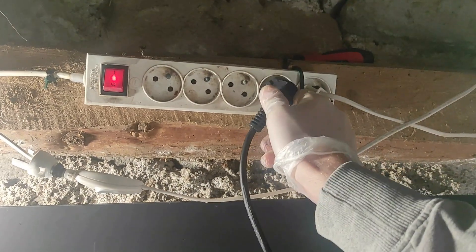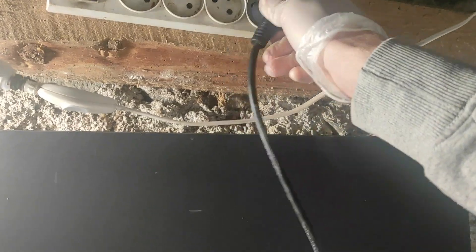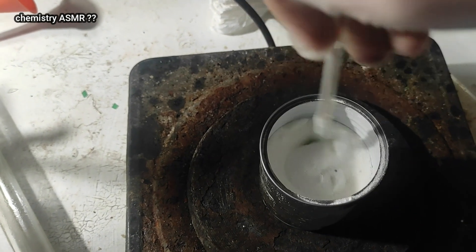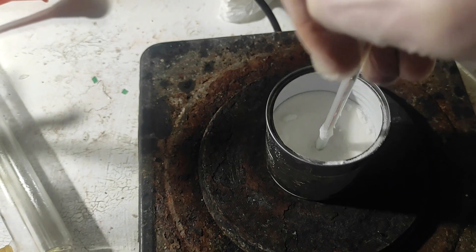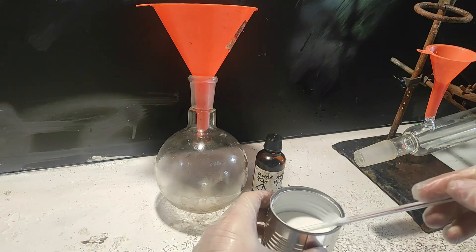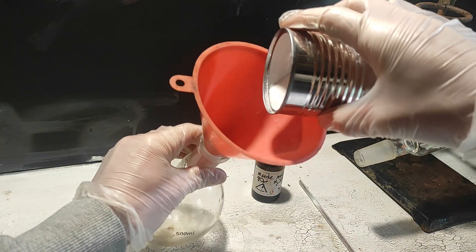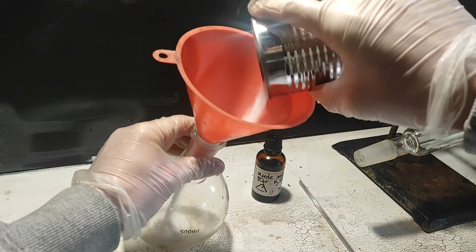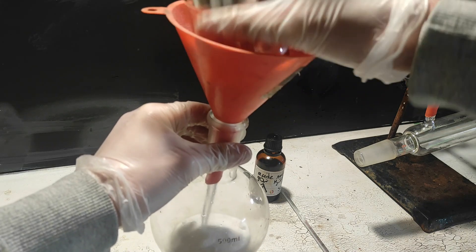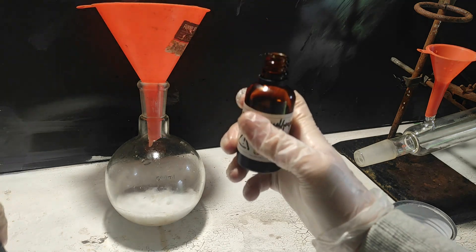Also, am I the only one who can't use a plug outlet? Just go in please, you're making me lose my time. Now we just need to put the reagents in the flask and assemble the apparatus.